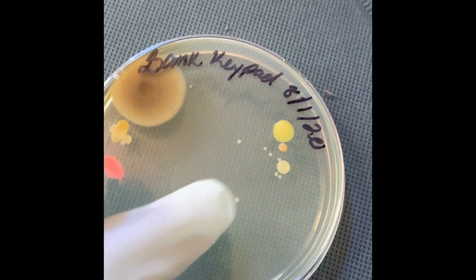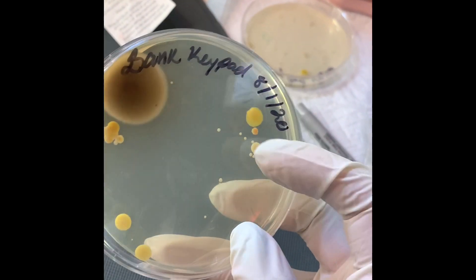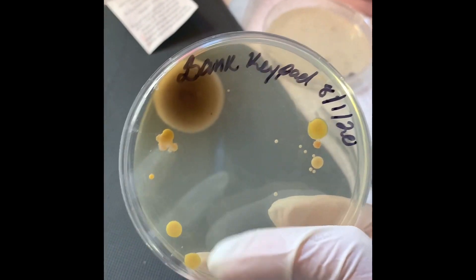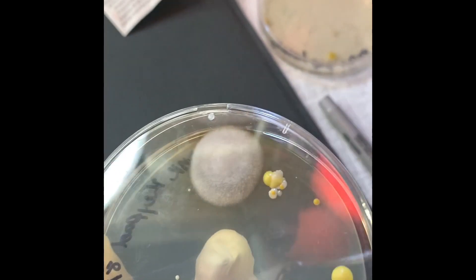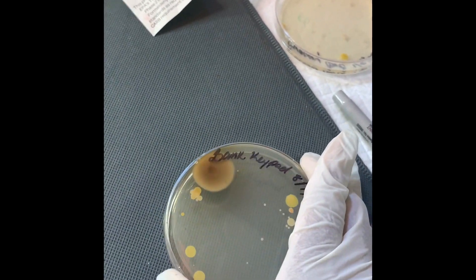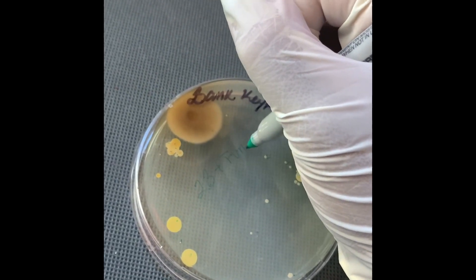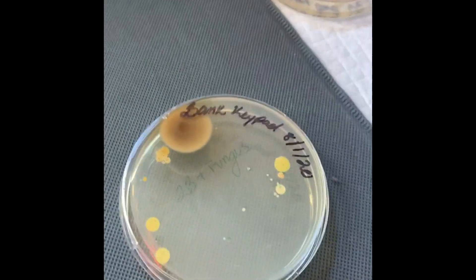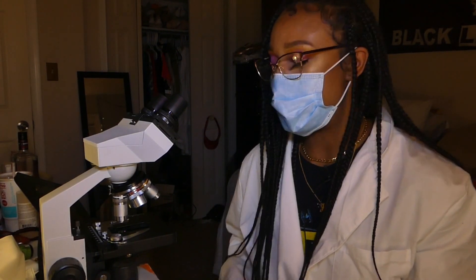You can definitely see a more variety of colonies on the bank keypad. You see these small yellowish ones, and then you clearly see that big fuzzy spot — fuzzy usually means fungus. So the count is 23 colonies plus fungus. That is what y'all are touching at the bank keypad.